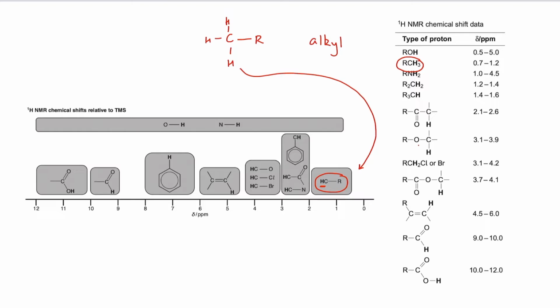In the table data sheet, you'll notice that if I were to replace that hydrogen, say, with another methyl group, then these 2 protons are part of CH2, R2, and we've got a slightly different range where we'd expect to see our peak. On the data sheet that looks like this, it's all lumped together as one type of proton environment. So practice makes perfect here.